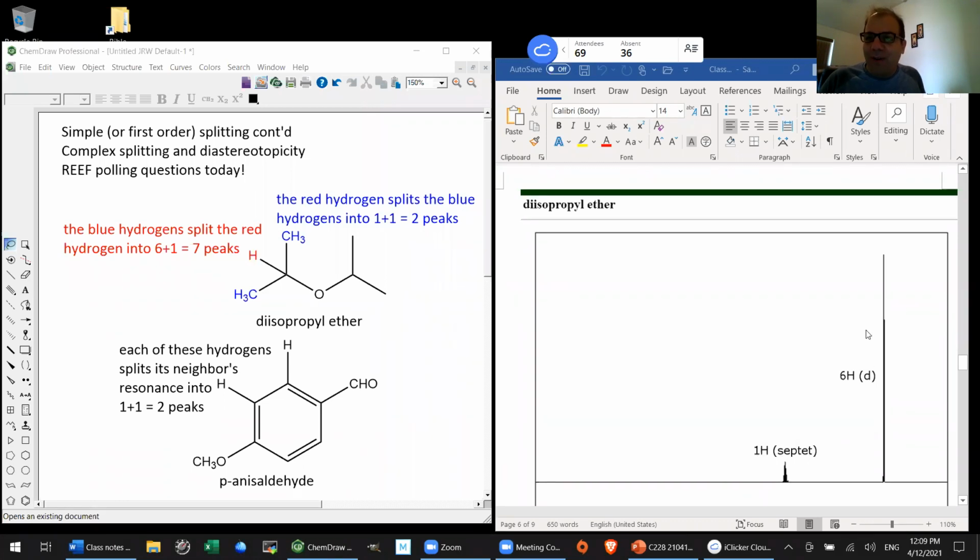If the splitting is very easy to see, I would not even tell you. But sometimes it's rather crowded like that. And as I've said, I'm not too proud to use ChemDraw to predict the spectrum, since as you saw last week, the calculated spectrum can actually come out very much easier to see than the actual experimental data. And we'll get to other things. I might mention a few other things that I am not too proud to do on spectroscopy exams. But so much for diisopropyl ether.